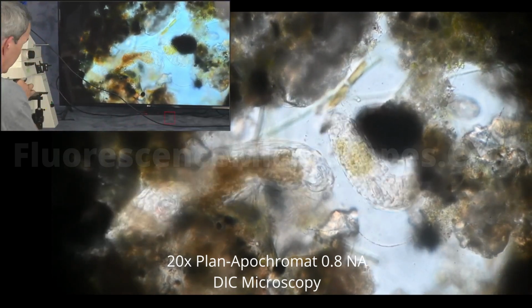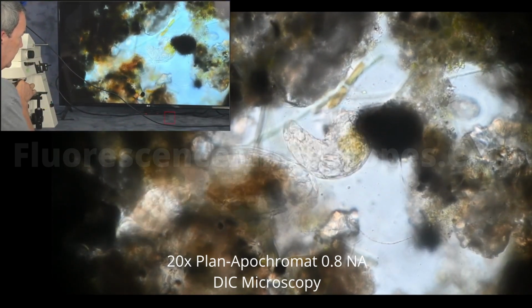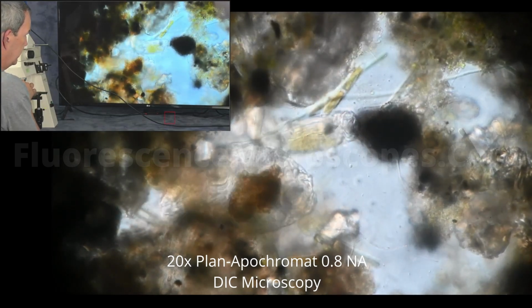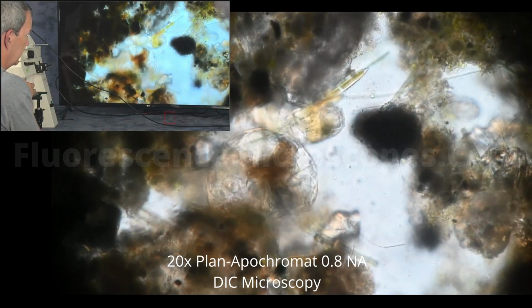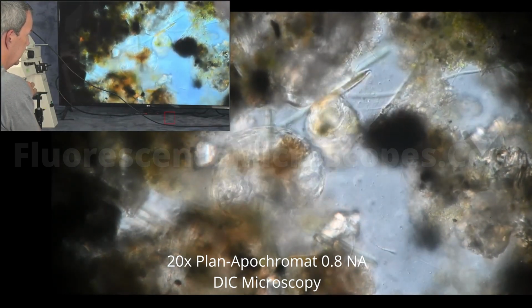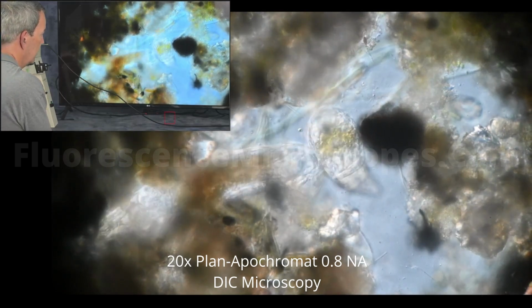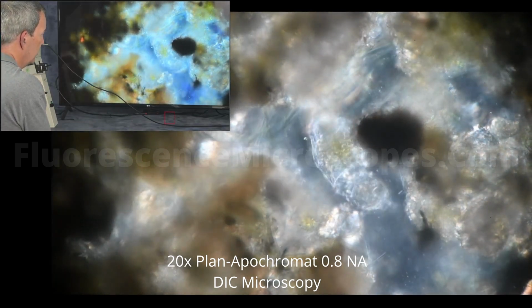I'm just doing some different things to get some contrast. I'm adjusting my shear plane on the DIC. These are moving around quite a bit, so it's hard to get much in focus.